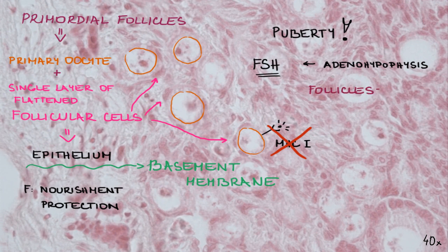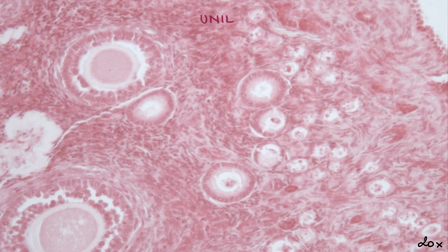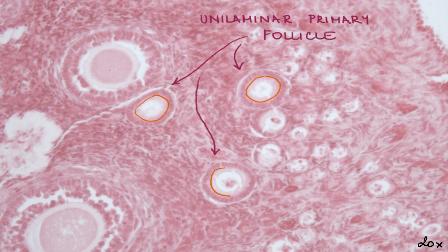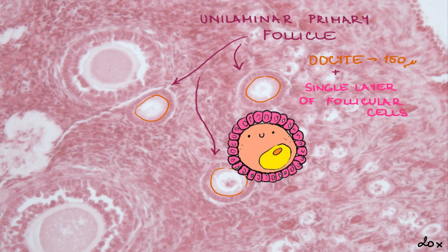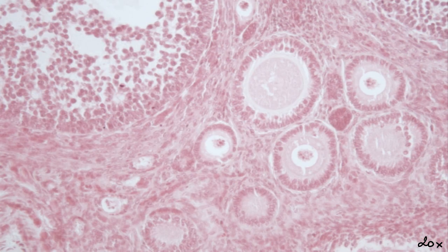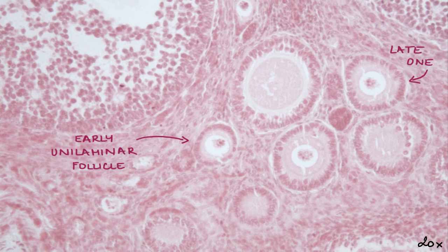We distinguish primary, secondary, and mature or Graafian follicles. Now let's look at how a primordial follicle changes into a unilaminar primary follicle, which still consists of an oocyte and a single layer of follicular cells. In the first phase, the oocyte continues its growth and its diameter reaches up to 150 micrometers. Follicular cells form a simple cuboidal or even columnar epithelium around the growing oocyte and also produce proteins. Stages of development are not strictly demarcated, so we can distinguish an early and a late unilaminar primary follicle. The late unilaminar primary follicle is bigger in size but still has only one layer of follicular cells.